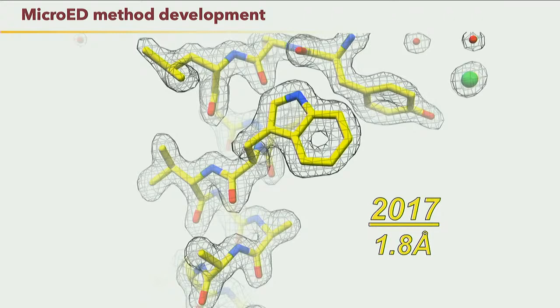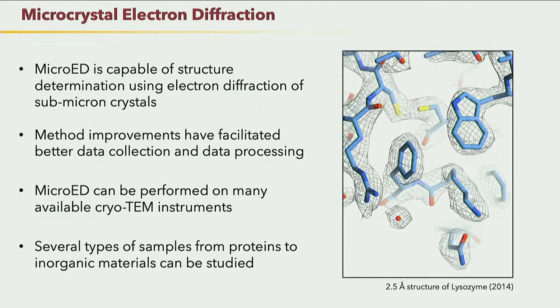There are a lot of questions I'm sure I'm going to get from the audience about that, so I'll leave it at that. So in summary, MicroED is a great way to solve structures from tiny little crystals. For proteins, it takes a lot of work. Proteins are still difficult. Proteins are always difficult, right? For small molecules, there are other difficulties, but it can actually be pretty straightforward. And like I said, even though that's not what we were thinking at the time, that's kind of where MicroED is going.